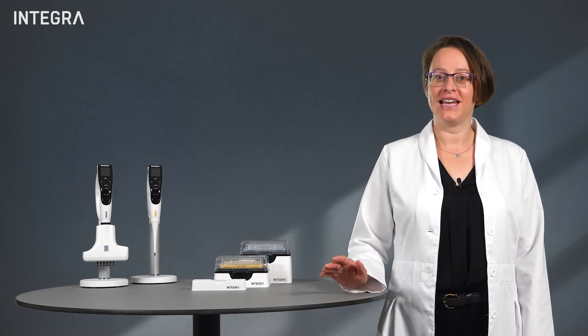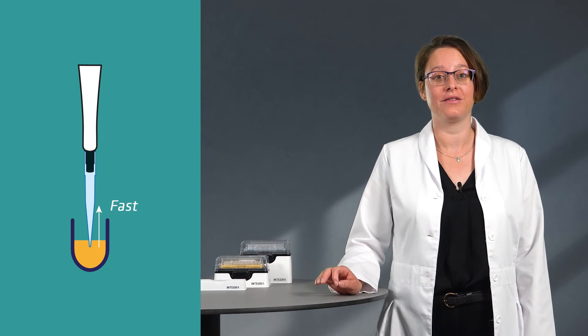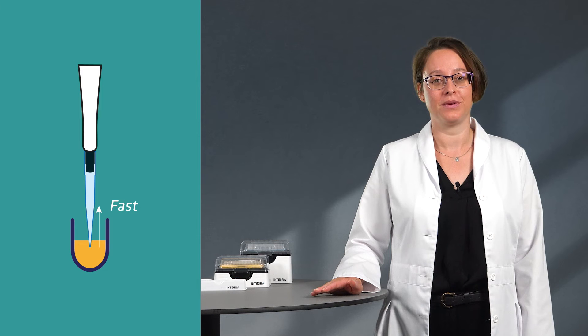The best speed of aspirating and dispensing can sometimes vary from liquid to liquid. However, with all volatile liquids, it's recommended to work quickly after aspiration.